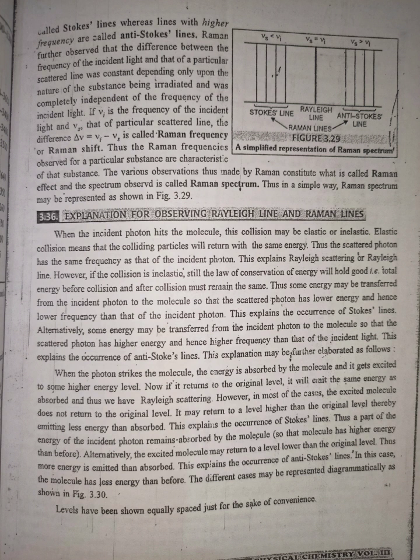The various observations made by Raman constitute what is called the Raman effect, and the spectrum observed is called Raman spectrum. Thus, in a simple way, Raman spectrum may be represented as shown.